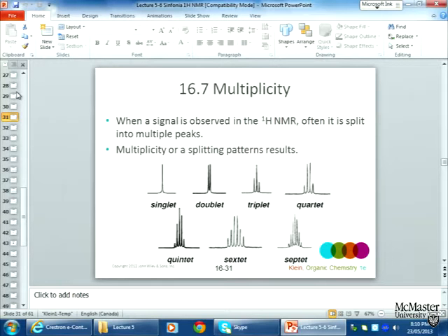And we can't really get that connectivity information from carbon NMR. Carbon NMR tells us about the carbons, but it doesn't tell you anything about this carbon being connected to that carbon. And in proton NMR, chemical shifts and integration don't tell us where, they tell us the total number of methylenes and methynes and so on, but we don't get the connectivity. So, in fact, getting the connectivity is really the most important thing to finish the structure. We work our way through.